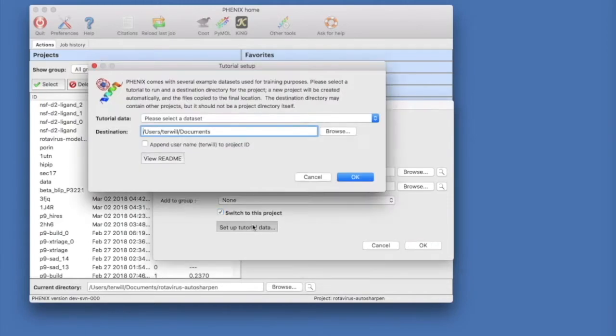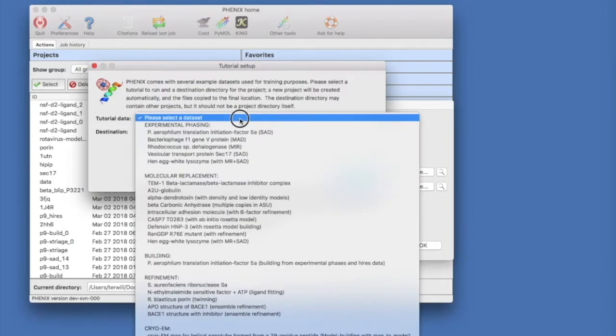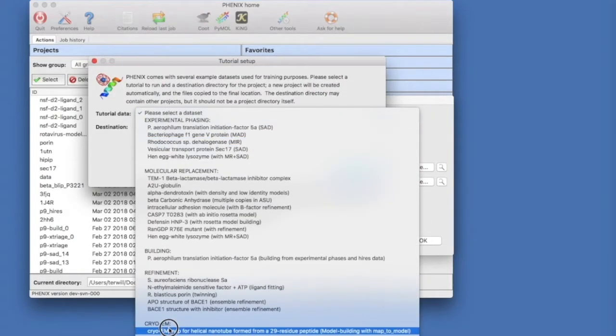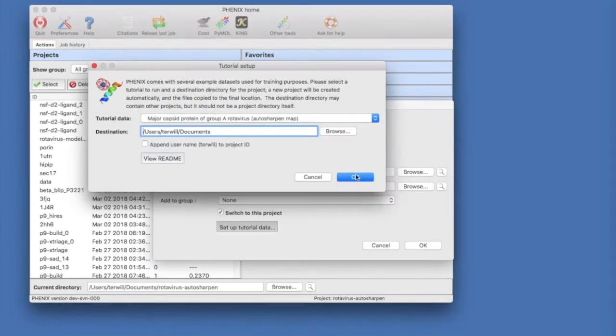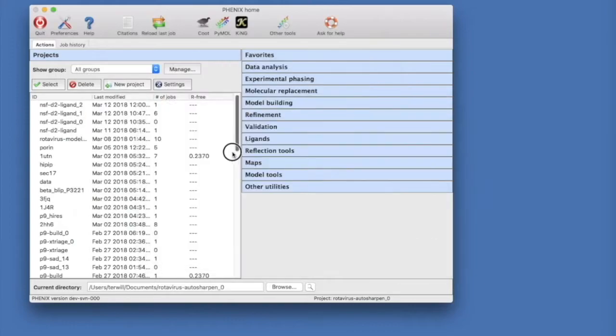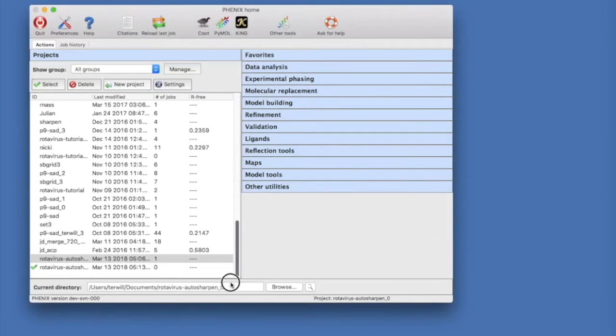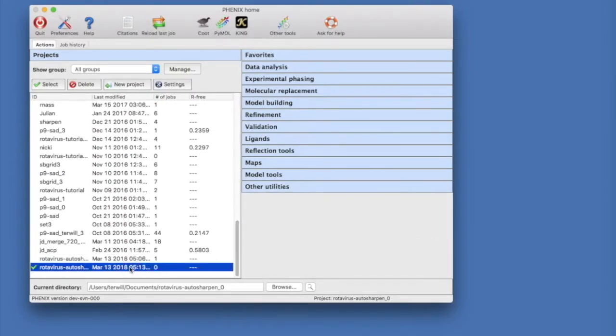Then under Please Select a Data Set, go down to the cryo-EM datasets and pick the auto sharpen map tutorial. Choose a suitable place to put this data and hit OK. Now there will be a new rotavirus auto sharpening project ready for you to use.